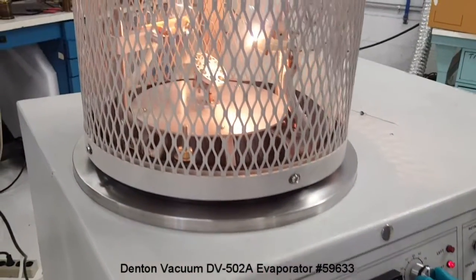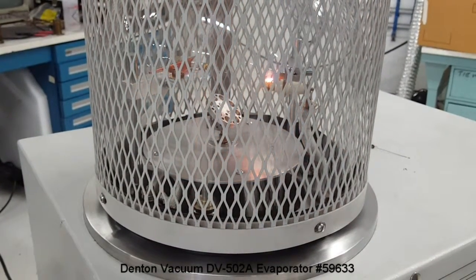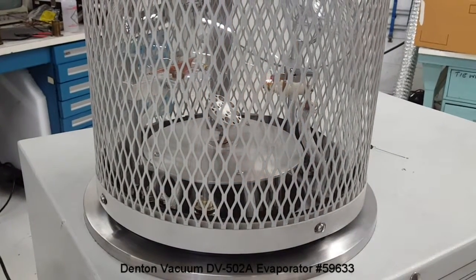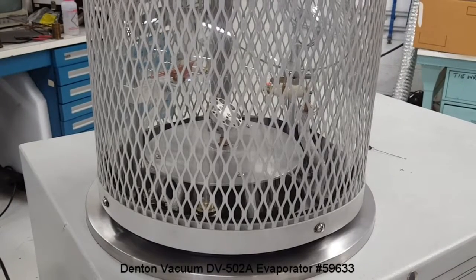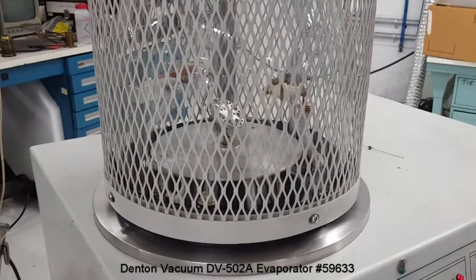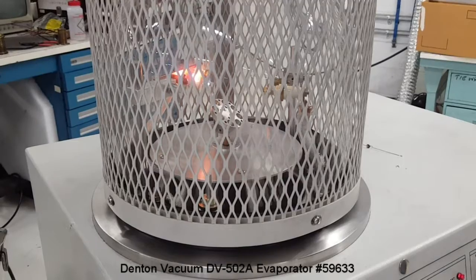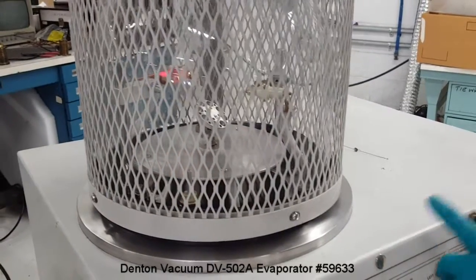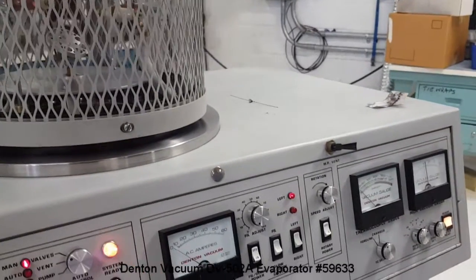So that's the right filament. The system was pumped down to mid-sixth range using the mechanical pump and diffusion pump, and it is ready for thermal evaporation. Right now I'm just turning on the filaments without material in them for demonstration purposes.